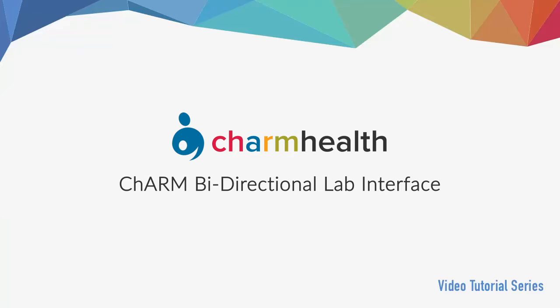This Charm bi-directional interface video tutorial explains how interface works between bi-directional interface labs and Charm EHR for sending orders and receiving results electronically.